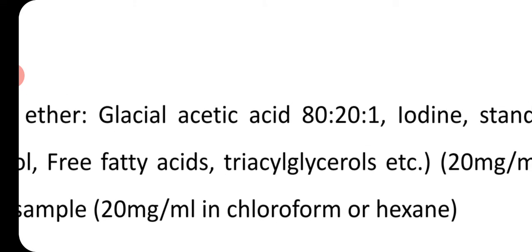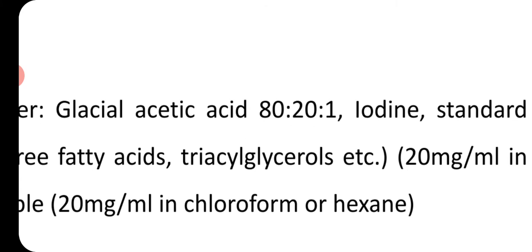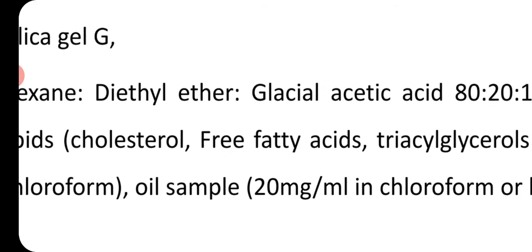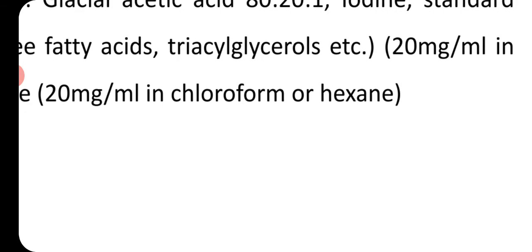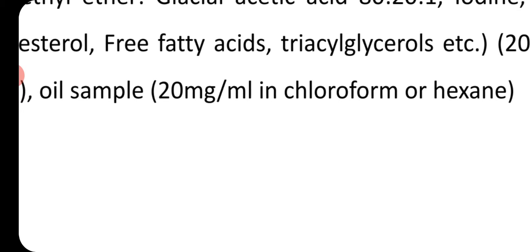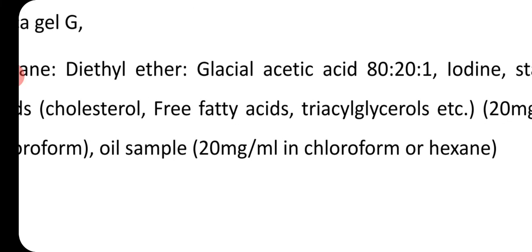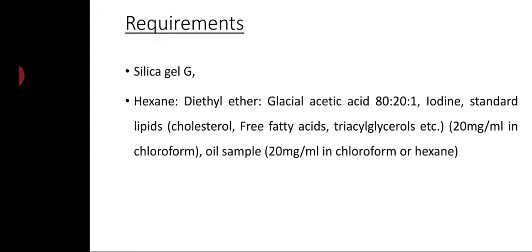You need iodine. You have used iodine before, that was iodine solution. Here you are going to use iodine crystals. Then you need standards of lipids like cholesterol, or an oil sample, whatever you are taking, and you need to dissolve it in a certain solvent. As I have already written over here, 20 milligram per ml in chloroform if you are taking cholesterol, free fatty acids, triglycerols, etc. If you are taking an oil sample, you are going to take 20 milligram per ml in chloroform or hexane.